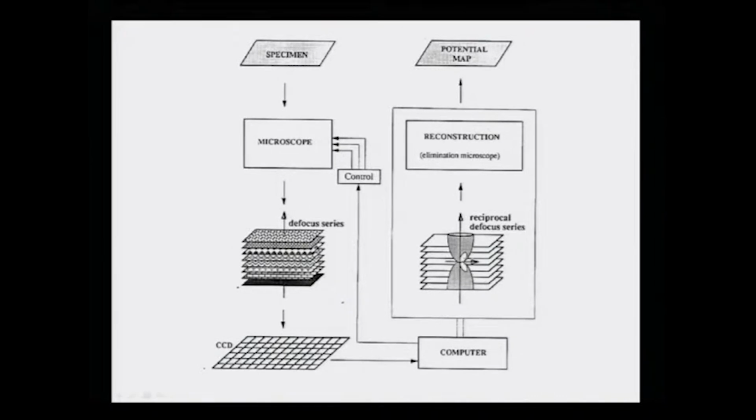As you know, during the imaging process, the electrons undergo 3 distinct interactions, if we list them in a very short form, and each of these interactions can be simulated in a computer.